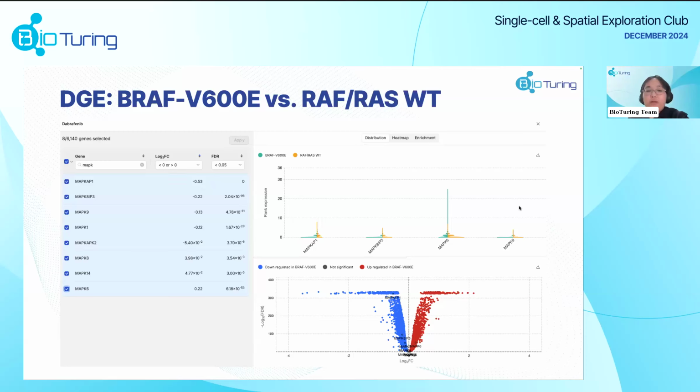And in here, by performing DGE, we can identify the key genes. And eventually, we can also perform pathway enrichment to find pathways that were affected by drug treatment and gain a better understanding of the underlying mechanism. And that's one workflow that we try to demonstrate to show how we reproduce and go deeper into the findings from Tahoe-100M.